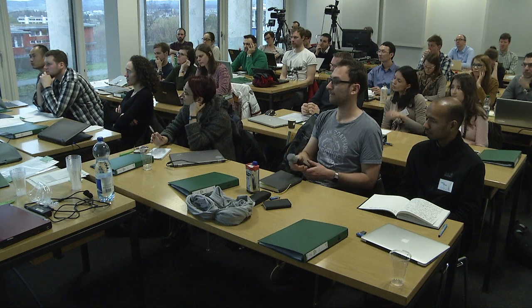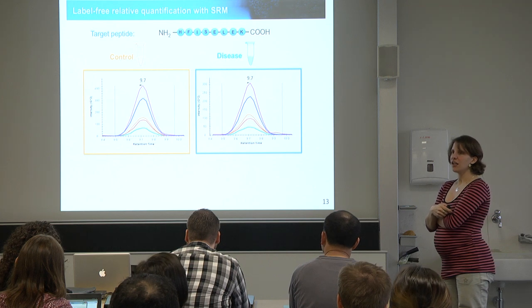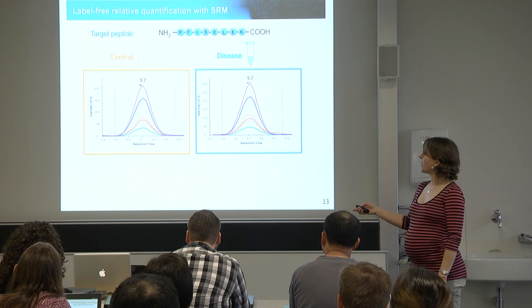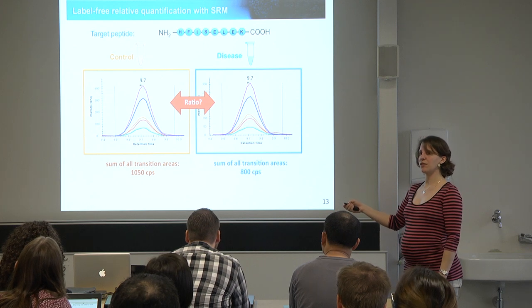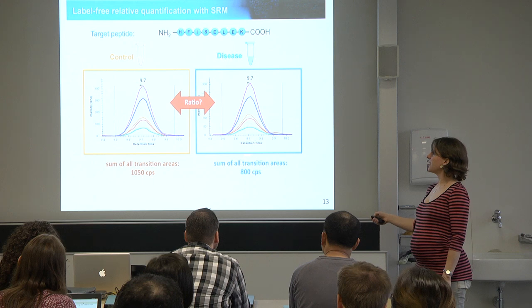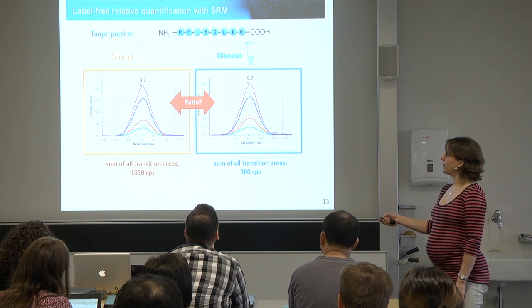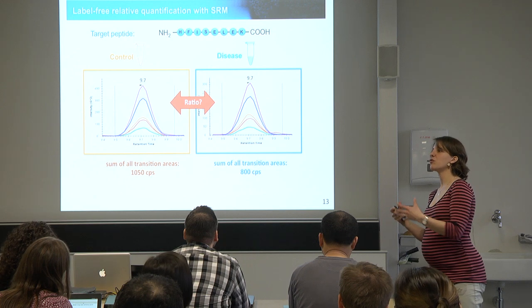One option, and that's the option that Skyline does: if you export ratios in Skyline, usually the way Skyline computes a peptide ratio is that it sums up all the intensities in one sample of one channel, sums up all the intensities of the other one, and then takes the ratio of the 2. One nice feature of this approach is that depending on the intensity of the peak, you weigh certain transitions more than others.